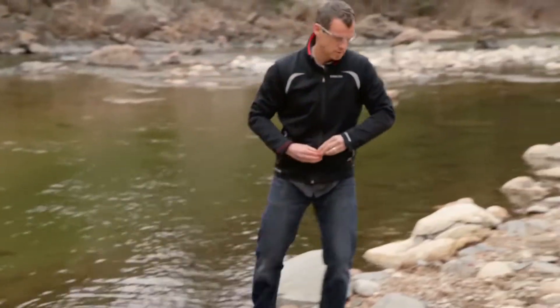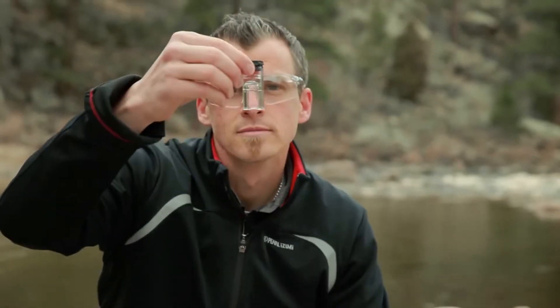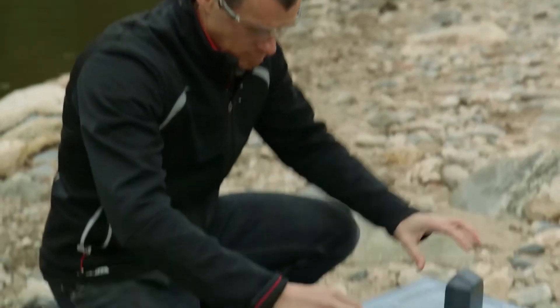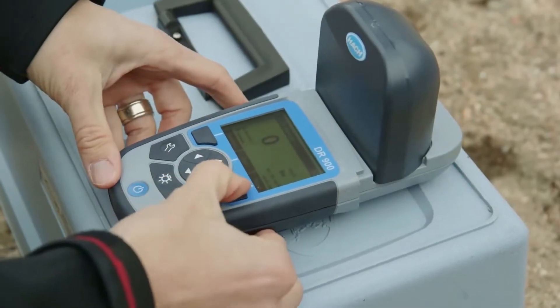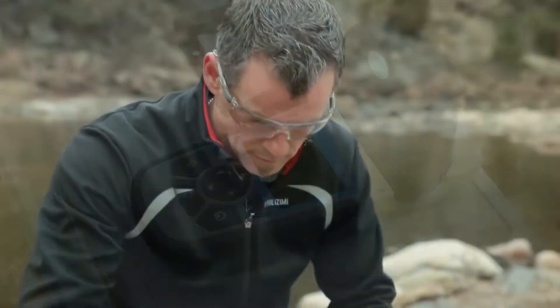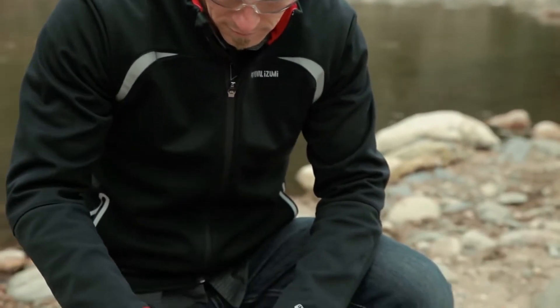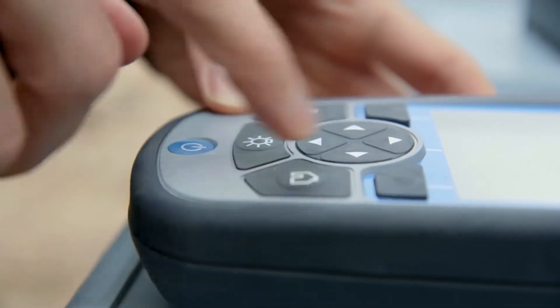We know you want to simplify your testing, so you need equipment that tests as many parameters as possible, and you can't be fumbling around with extra manuals. What does ideal look like in the field? Something that allows you to test your most common parameters quickly. Ideal is equipment protected against the elements. Ideal means you test easily and have confidence in the data without transcription errors.